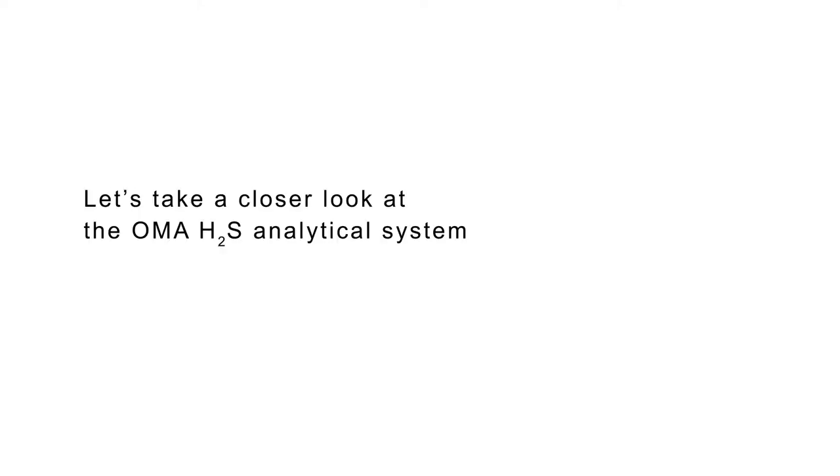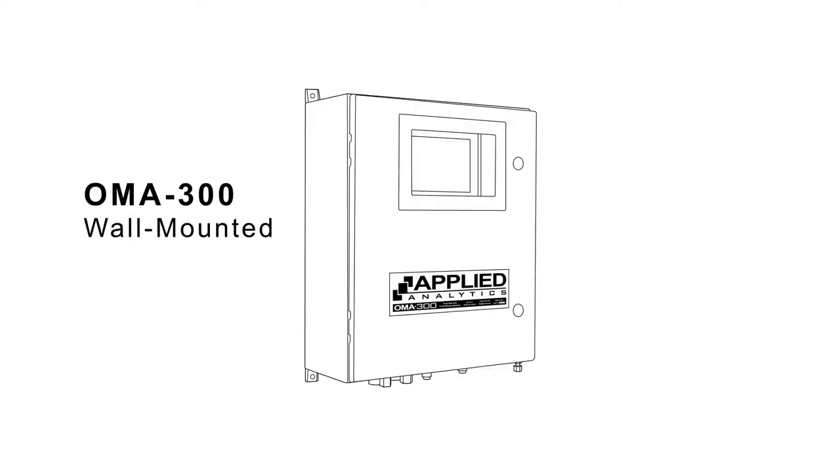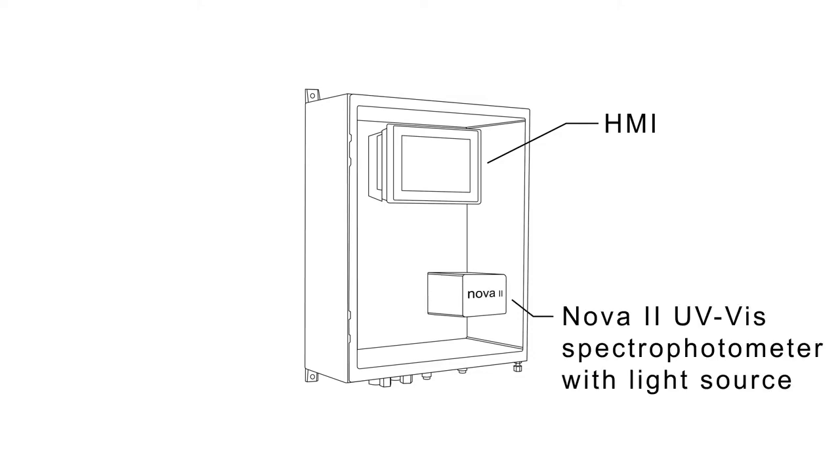Analyzer and flow cell/sample conditioning system connections. Let's take a closer look at the OMA H2S analytical system. This is an OMA process analyzer with a standard wall-mounted enclosure. Inside the analyzer enclosure, there is an HMI unit, a Nova 2 UV-Vis spectrophotometer with a light source, and an I/O board, which is behind the HMI.